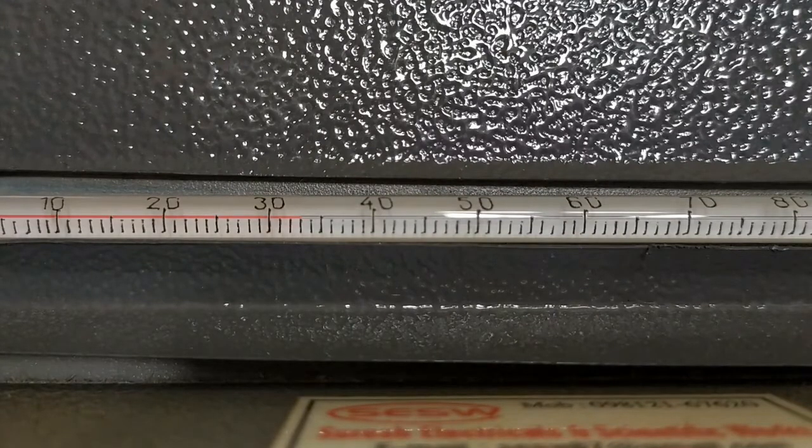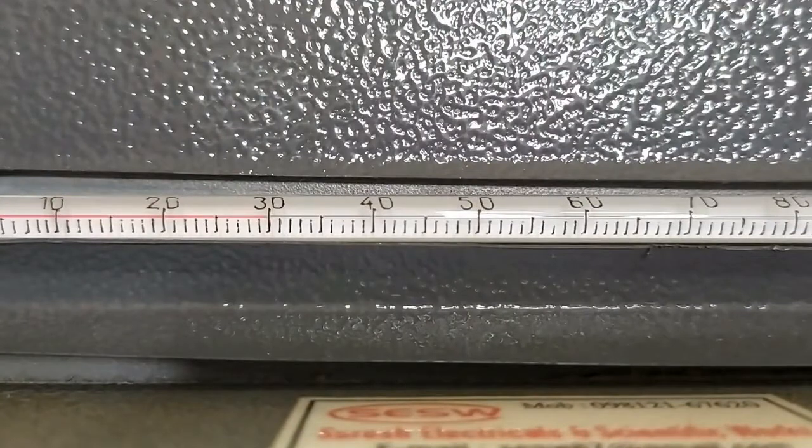As you can see, in one instance, the thermometer reading goes all the way up to 35 degrees, despite the thermostat being set at 30 degrees. It comes back to 30 degrees, which is when the thermostat control sets in and the temperature rises back to about 35, and the cycle continues.